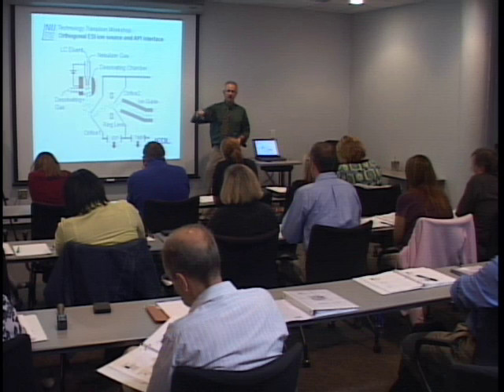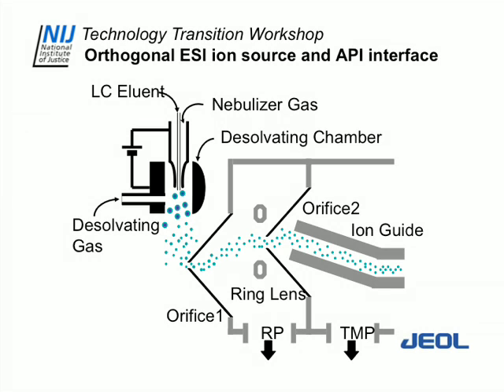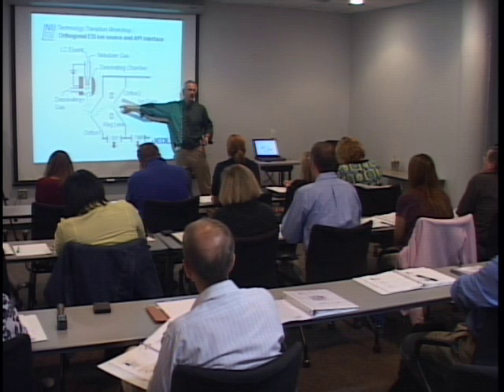It just moves ions from high pressure to low pressure, just kind of contains them and brings them in. But it's a bent RF ion guide, so if you look at it, it's at an angle. That's also to keep the contamination out. The back end of this goes into the high vacuum region, and it's a precision quadrupole. You don't want to get it all gunked up. So bending it this way, at the very least, you might see a tiny film on the opening of the quadrupole, but it won't get very dirty.